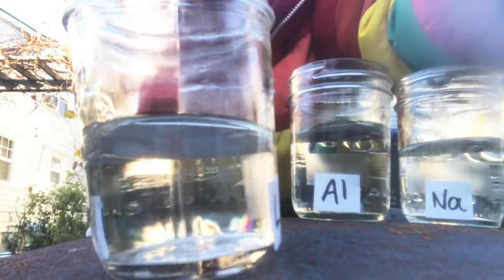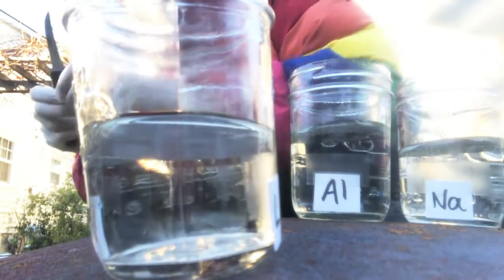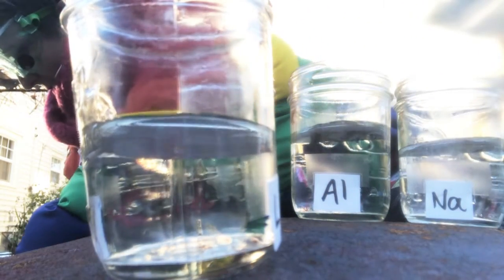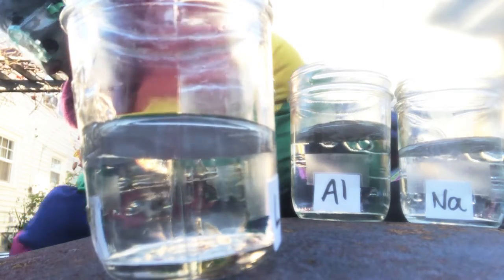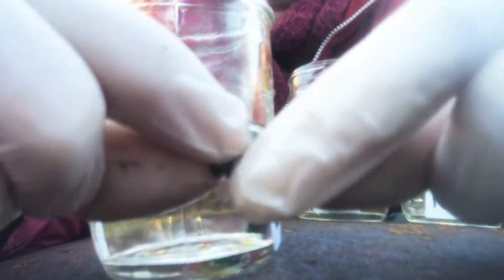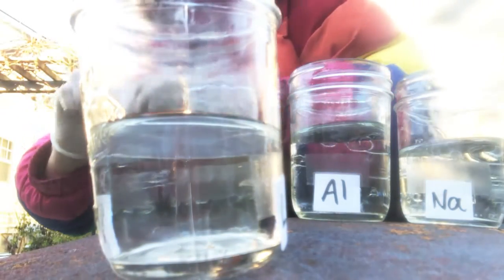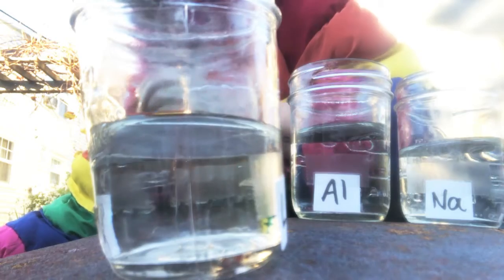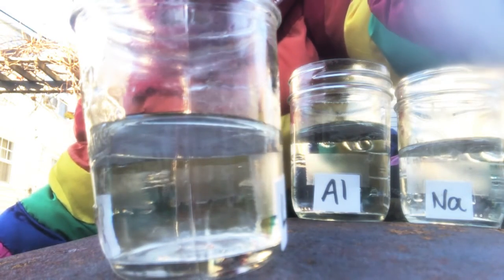Here we go. You can kind of see a little bit. It's a silvery metal, and it is a little bit hard to cut. I can cut it with a regular knife from my kitchen, but you can see there's a little bit of silver that kind of peeks out when I cut it. We'll talk more about what's going on there. And I'll close the lid of the lithium. And here we go. Here's your lithium.